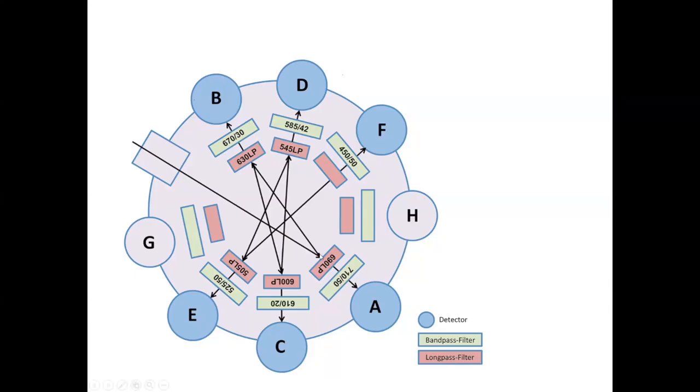So all the deflectors, you see there, this one comes here, goes through all the deflected light, then goes here, then some pass through it, and the other gets deflected, that comes here. So that's why you beautifully separate out the signals or the color light from that specific fluorochrome to that corresponding detector, right? Beauty, how they have designed.